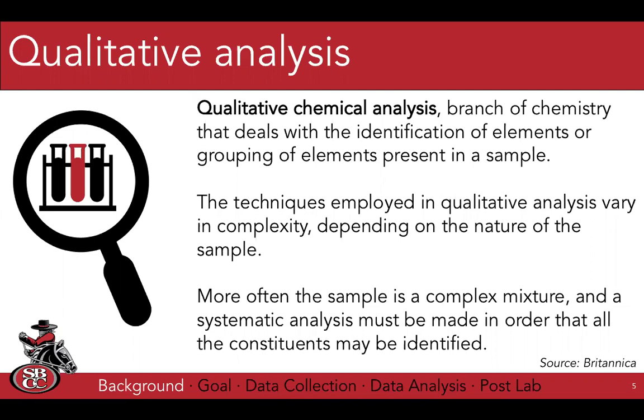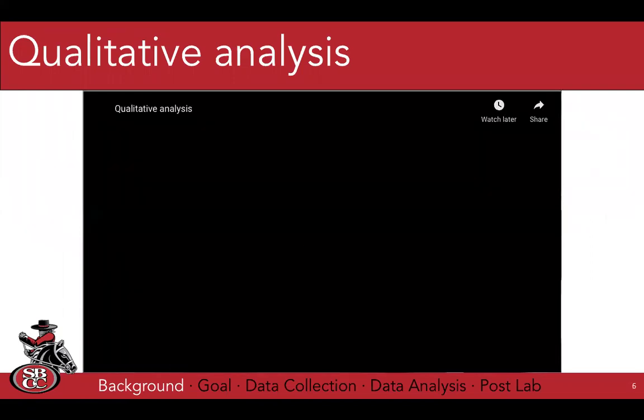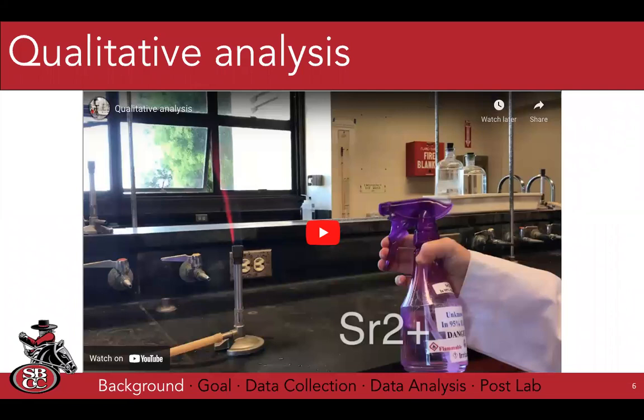And that's what we're going to be looking at today, the first part of our lab. And I'm going to leave the biggest part of our lab completely up to you to figure out. But the first part is going to deal with calibrating our sensor. But before we begin, almost every qualitative analysis lab that I've ever taught at any institution involves one of them, kind of a favorite qualitative analysis, which is flame tests.